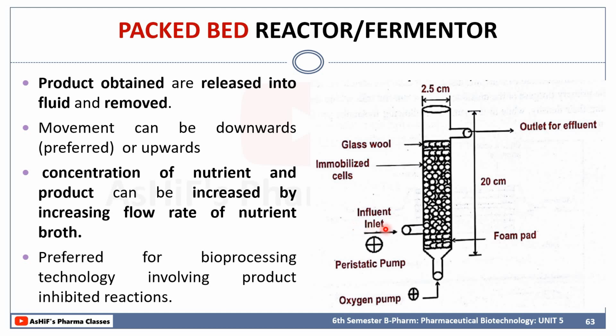Either we can give the inlet here or we can give inlet here. By giving inlet here, it will require some time to reach the outlet, so that there will be much time for the fermentation reaction. So concentration of the nutrient product can be increased by controlling the flow rate of the nutrients. So this is mainly preferred for bioprocessing technology involving product inhibited reactions. So that is the packed bed reactors.